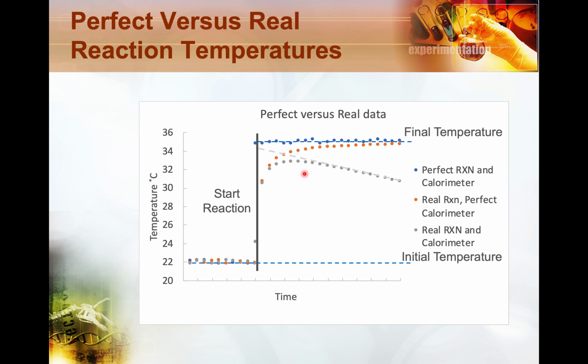So this is what you're going to do in the experiment: you'll get the mass of your cup, you'll add the solution, get the mass of those combined things, start getting the temperature so you can get a good accurate estimate of the initial temperature, and then you'll get some points of the temperature over time. You want to wait for a while to collect some good data. I would say probably at least 10 minutes, but we'll look to see how long it takes. Just measure and write down all of these temperature points over time, and then at the end you can extrapolate to find out what the true final temperature of that reaction would be.